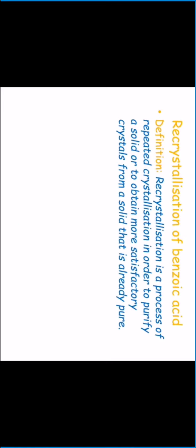So next we're going to look at the recrystallization of that benzoic acid sample that has just been prepared. And to begin this, it's important to know what recrystallization is.